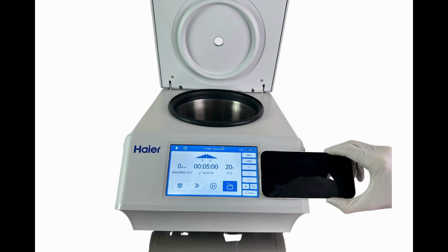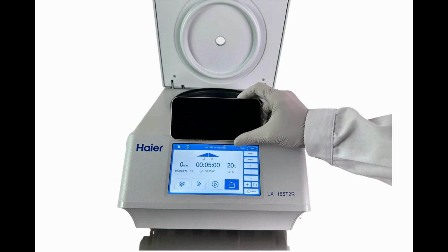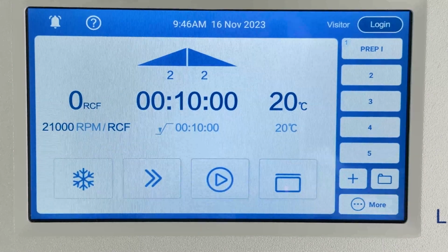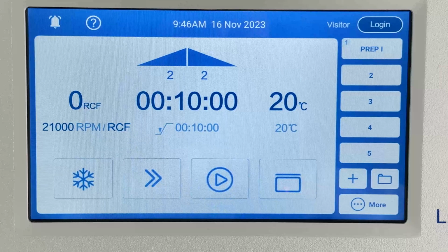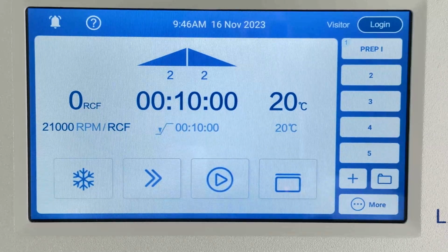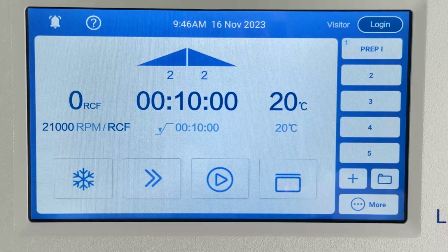So now let's take a look at the display, and the first thing to say is it's absolutely huge. You can see here compared to an iPhone Max, it's actually bigger. So the interface is extremely simple, going from left to right: speed, time, temperature. Up above that, you've got your acceleration and deceleration profiles.